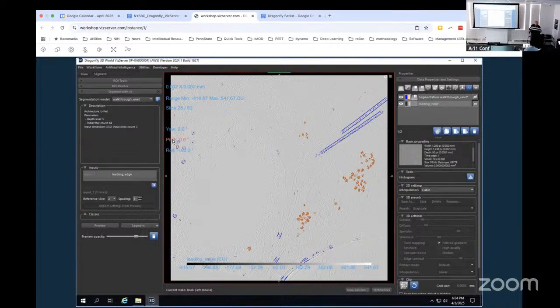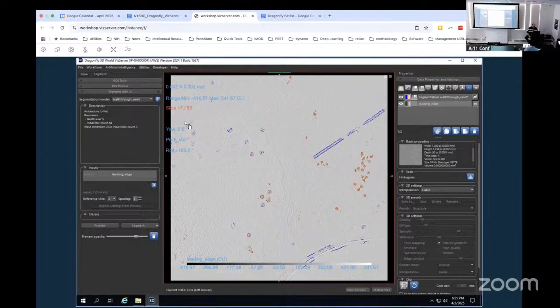No surprise, it did okay. Did everyone's actually infer? Okay. Now, it's not perfect. You'll see that it's finding things outside of the cell, like on the carbon, where weird little membranes are getting picked up as ribosomes.